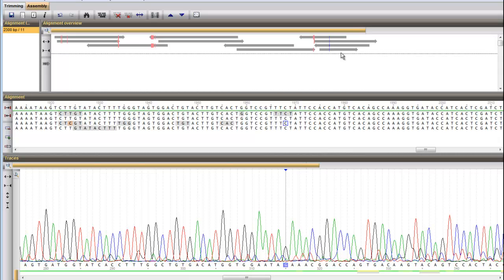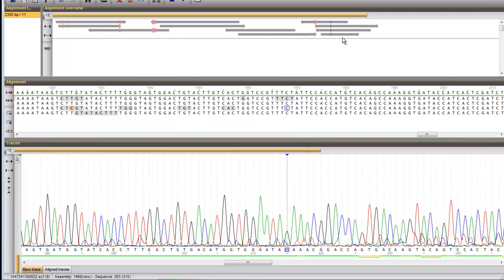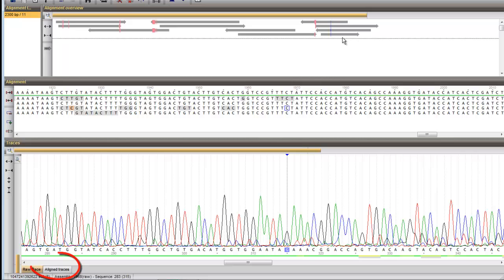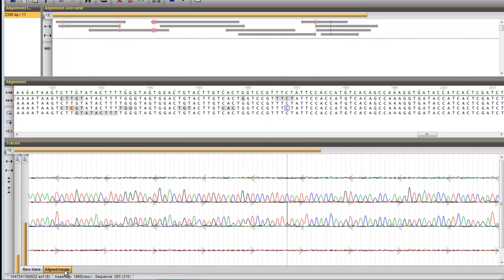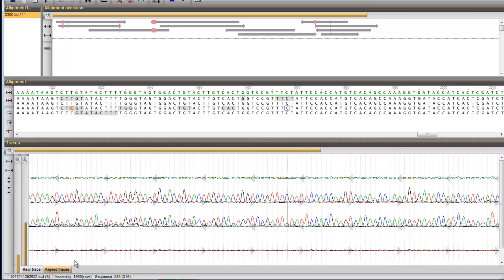The below panel can also be shown in Align mode by switching to the Aligned Traces tab. In this view, all available trace files for that position are shown.